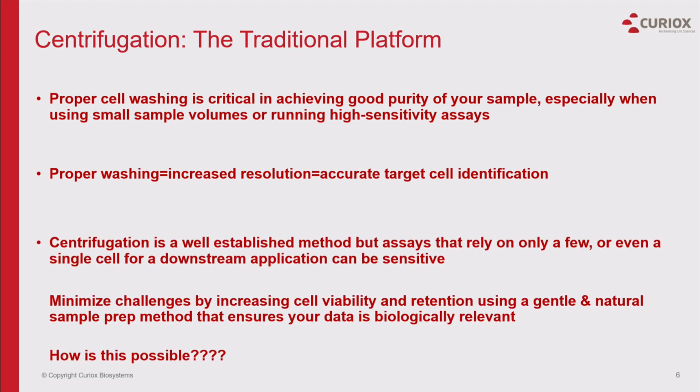So, as we all know, and I've said, centrifugation is a very well-established method, and we've used it for a long period of time. And usually with those samples that we've had the luxury of working with a lot of cells, myself included. I've been a T-cell immunologist my entire career. So working with these samples can be problematic.